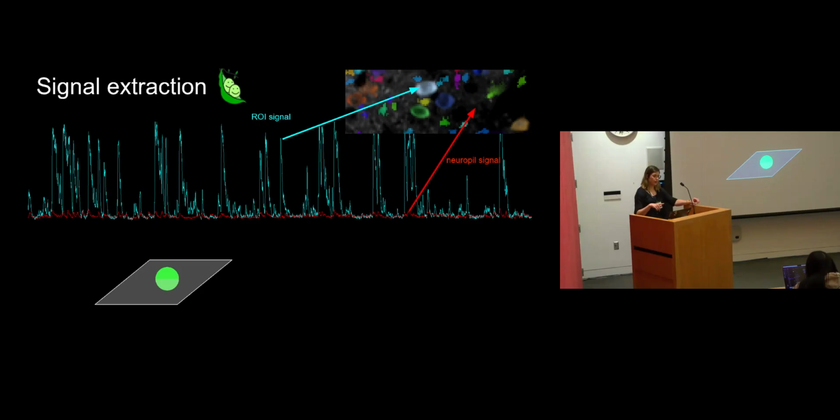And for long recordings, for the Z movement issue, we've developed a plugin in ScanImage, which is available for everyone now, for doing Z correction. That's what we use to make sure that we can do Z correction during very long recordings, because that is really important, especially for these big microscopes. They just move on their own, and so you need these kinds of things.